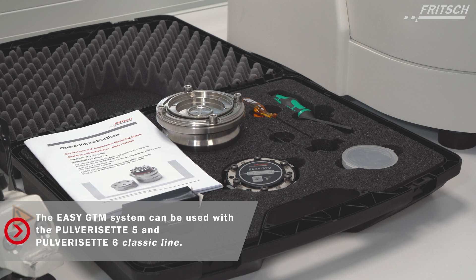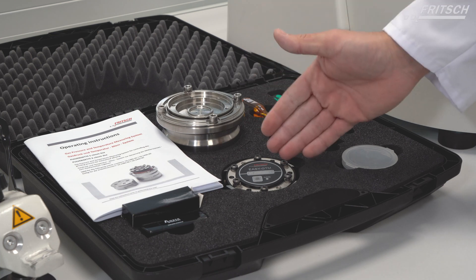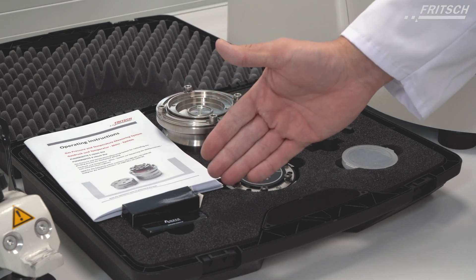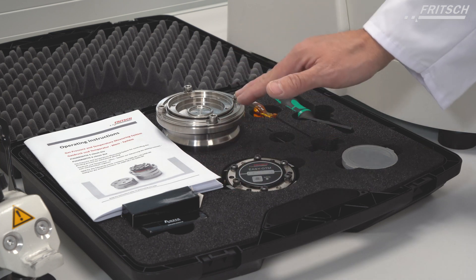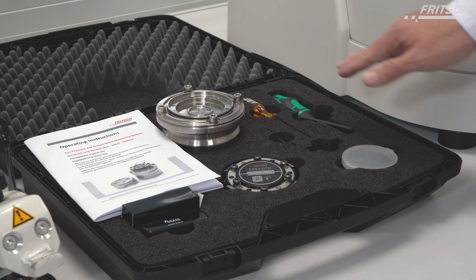In this EZ-GTM case you can find the operating instructions, you can find the measuring unit, you can find the USB stick with the software, the EZ-GTM bowl itself and all necessary tools.